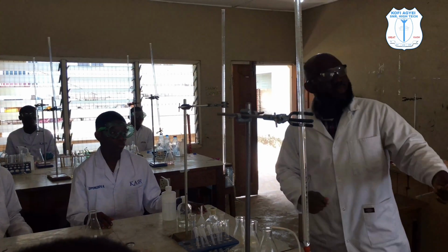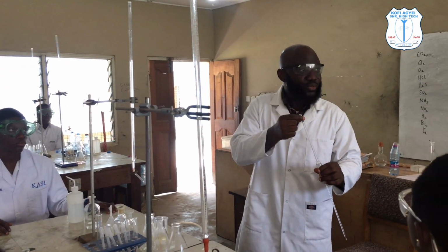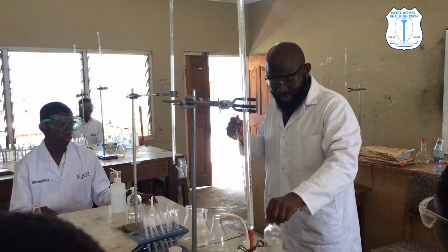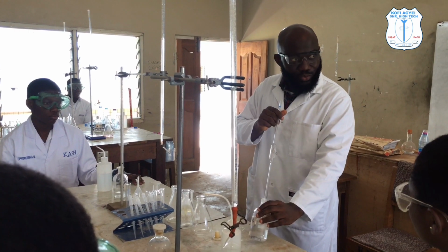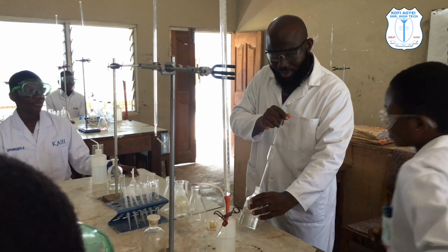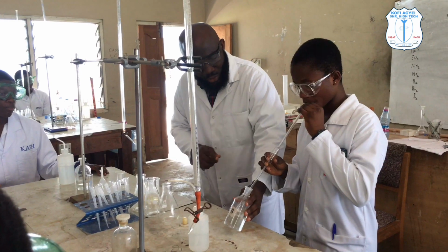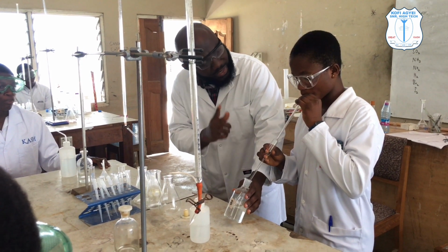Now this one is called the pipette. Now with the pipette, you are supposed to position your mouth over here. Then you set it gently into the base. Understood? Then you suck gently. But I'm not going to do that. You have to come around and do that. So right here, you suck gently. Make sure it doesn't get into your mouth.